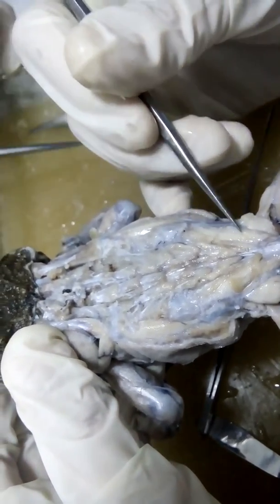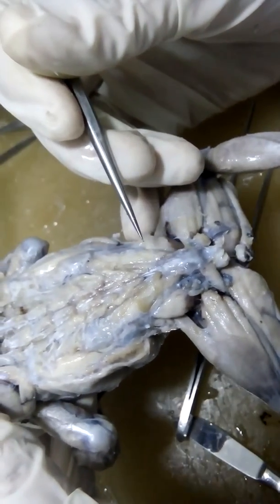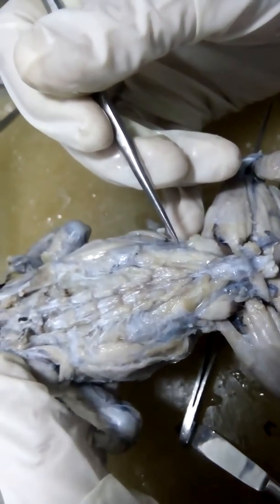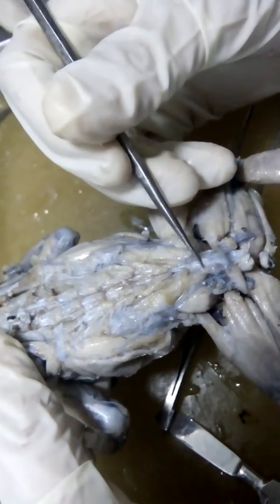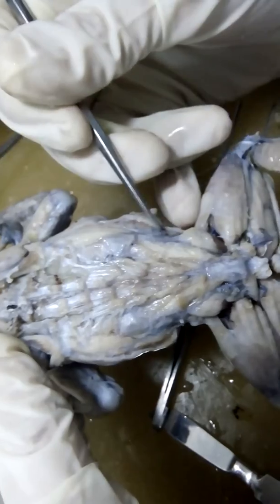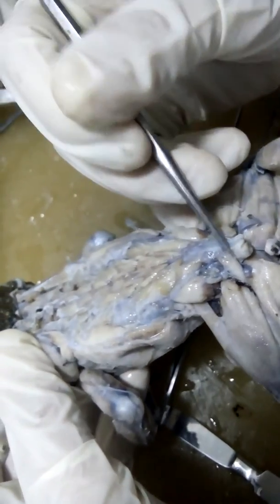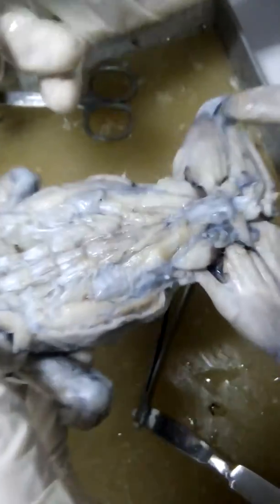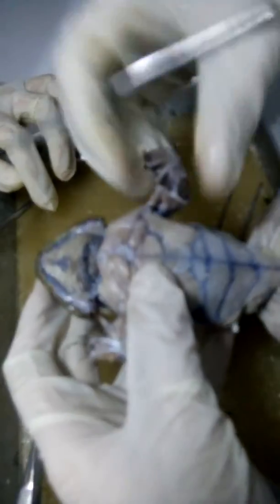This right here below your coccygeosacralis is your coccygeoiliacus. So connected to your ilium. So this is your gluteus, and this right here surrounding your cloaca is your piriformis.